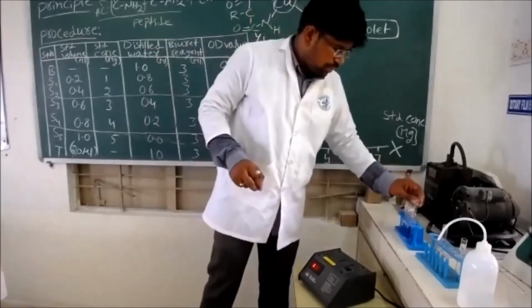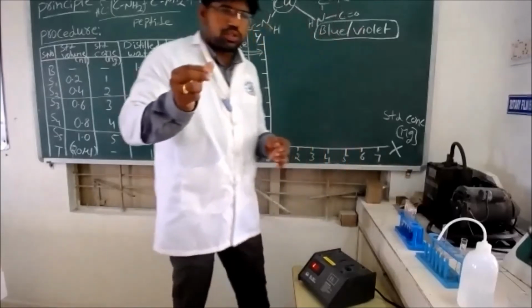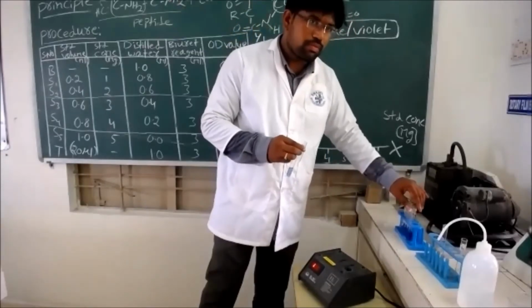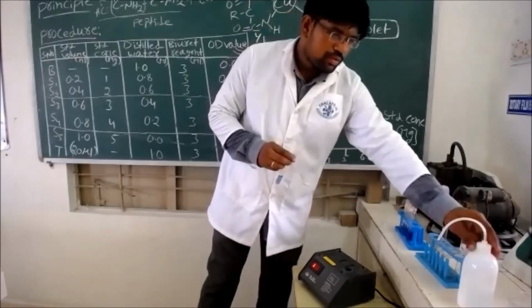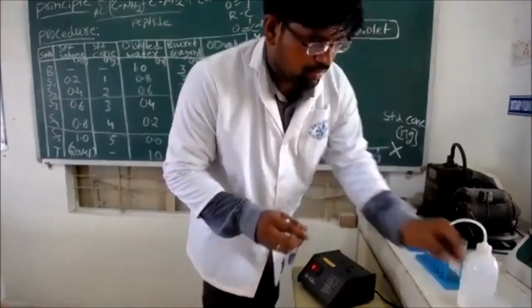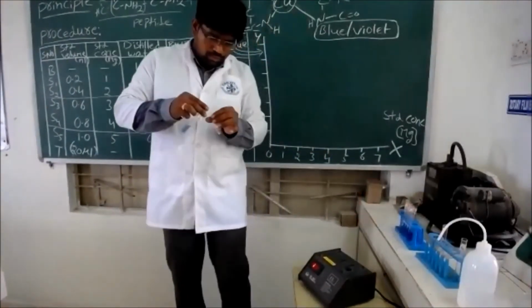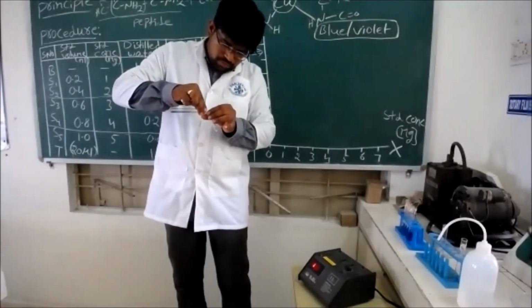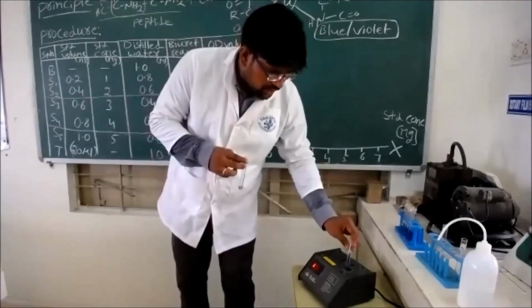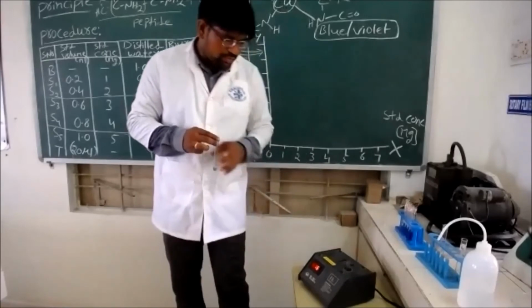Now measure the absorbance of the test. So this is the test. Similarly, measure the absorbance of the test also and note down the absorbance.